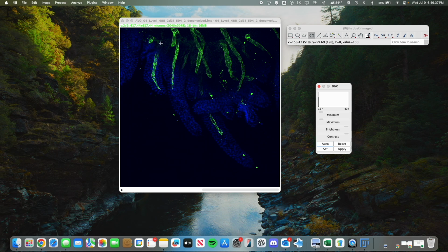So one thing I do have to mention, though, is when you use the freehand selection, you lose the angle. When you're with a straight line selection, you get an angle of the line compared to like 0 degrees. However, with a freehand selection, the line is curved, so there's no angle really that you can measure. So that's one thing you do lose. Keep that in mind if that's important to you. But in our case, we don't need that.